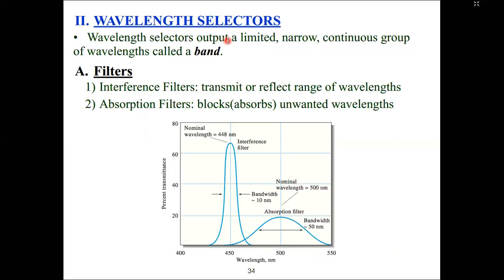Also, say you already know what wavelength are to be emitted by certain atoms. For example, if you are detecting sodium, then you can specifically select the wavelength that corresponds to the emission of the sodium and detect them. So you have the desired information only. You don't have to worry about all the wavelength. So how do you do that? You use the wavelength selector.